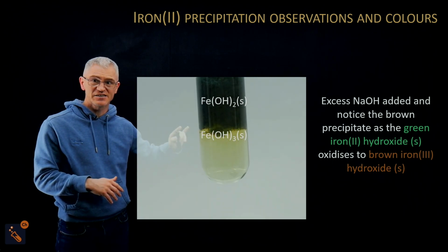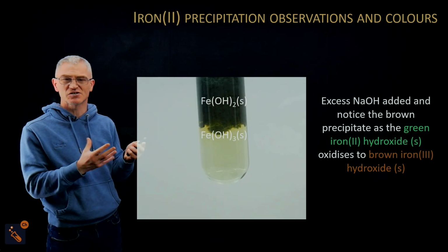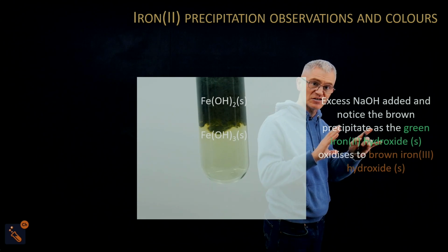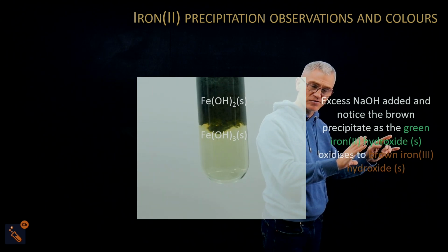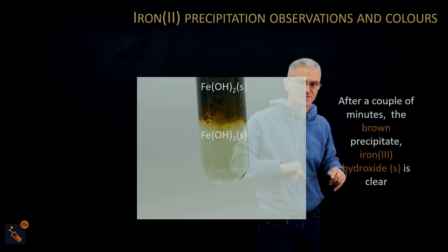And you see as well, it's starting to go brown on the edge. That's why the Fe2, it's just basically oxidizes a little bit further. That's why if you get excess, it oxidizes to the brown, just a little bit, not everywhere. And you can see it's more brown there, okay, after a couple of minutes.